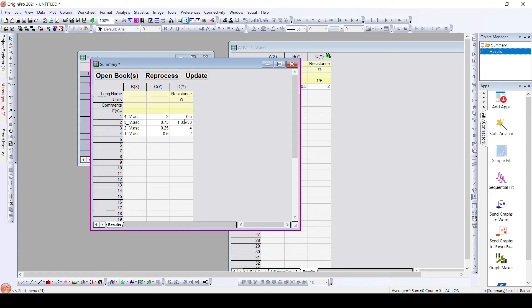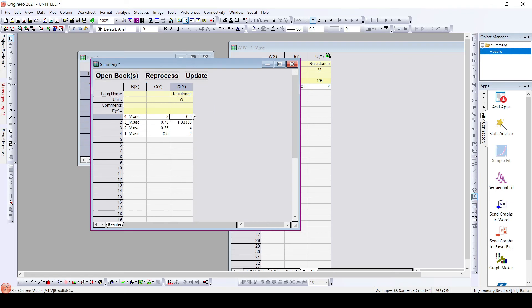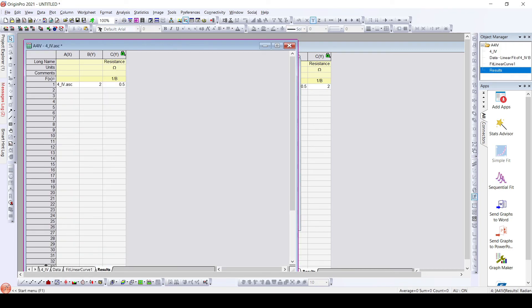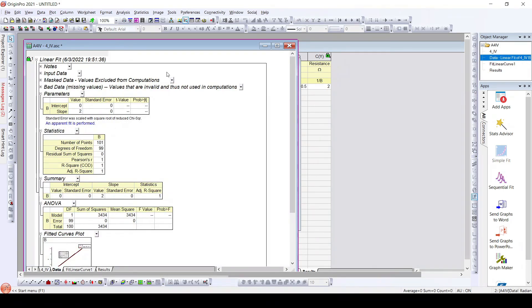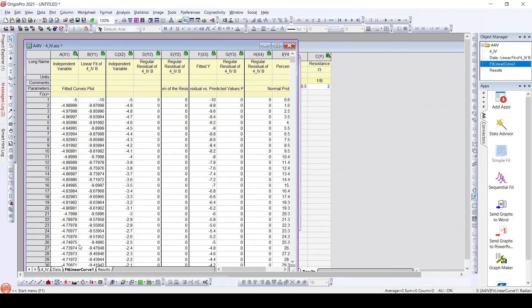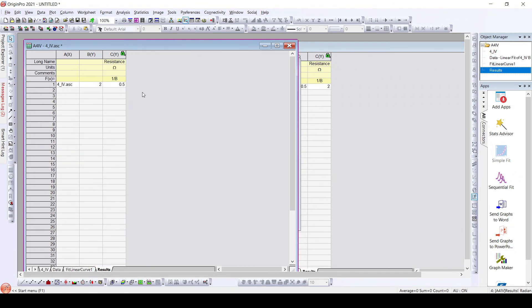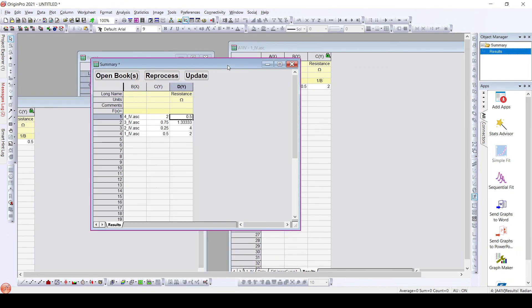We can individually see the workbooks that are generated by clicking on the data and clicking 'Open Books'. Once we click Open Books, we get the data file that we imported, the linear fit sheet, the fit linear curve, as well as the results file. This particular data is shown in the summary workbook and we can get the data directly.